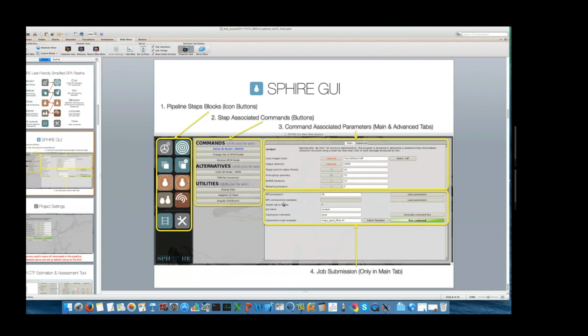The person suggested adding a few more parameters so that the software will have the flexibility to handle more complex settings of the job submission script. I think job submission is a tricky business because it can be customized for individual clusters and individual sites. It's not easy to satisfy everyone.